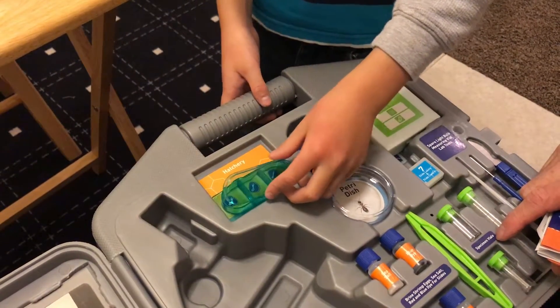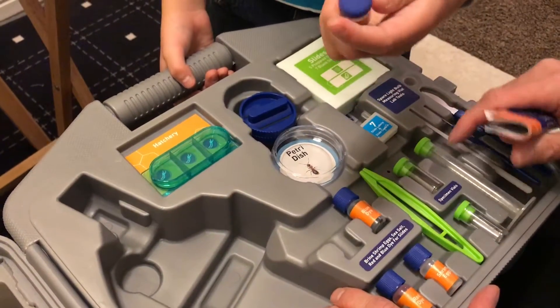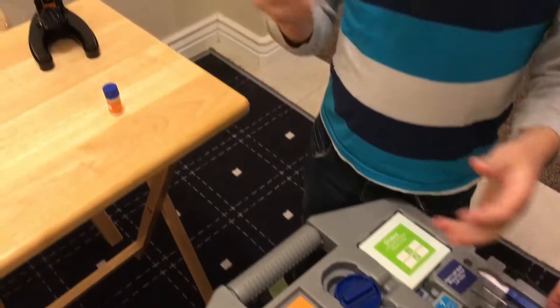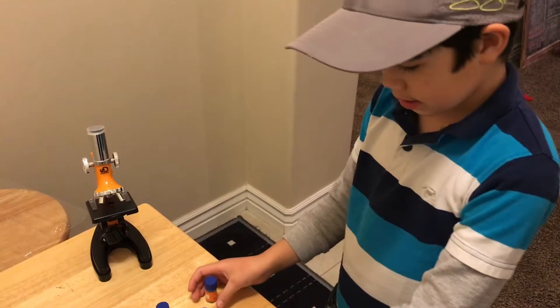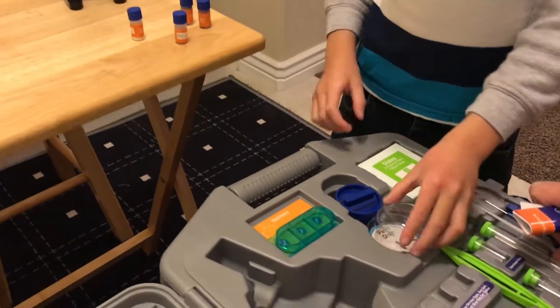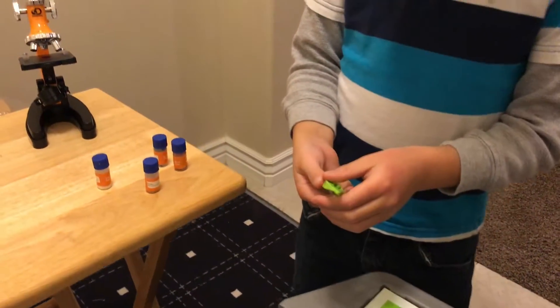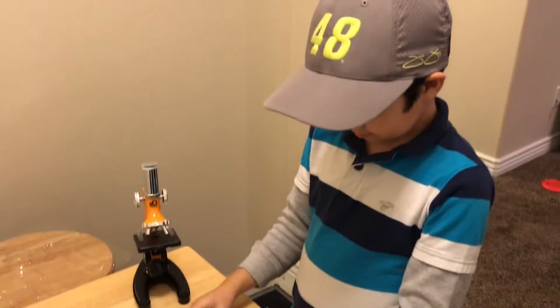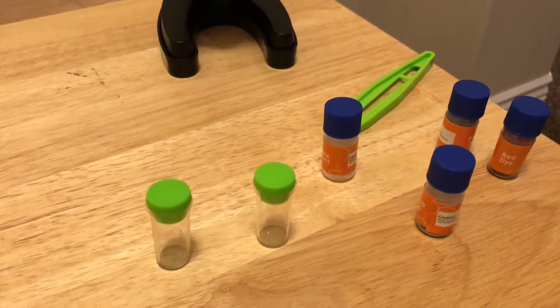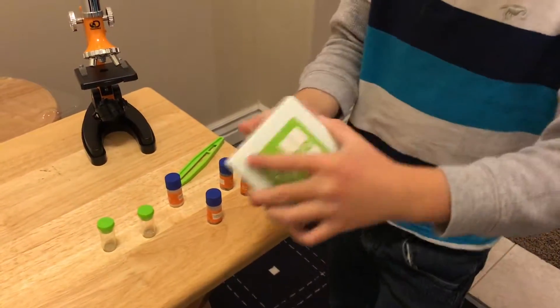It's got specimen vials — I guess we can go catch some bugs or something. Sea salt, test tube, blue dye, and some tools. You've got shrimp eggs and red dye. And then there's this thing — I don't know what that is. You've got these pliers, little specimen holders. That's the specimens they give you. Labels, cover slips.